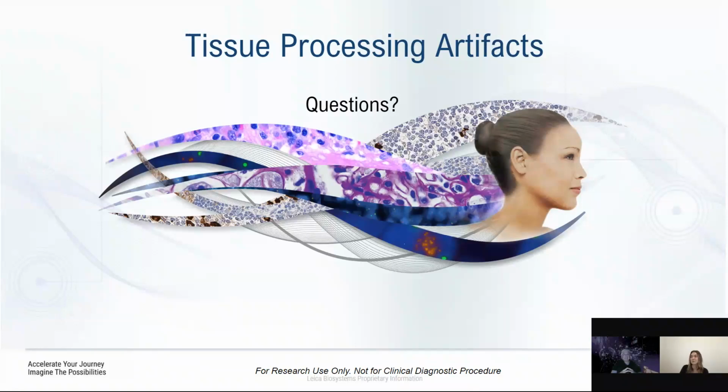Now, moving on, when performing reagent change on process, is there an expiration date different from the container to the process bottle? Should it be noted on the bottle for CAP, or state regulation? In the research site, that is a good question. I work on both sides. I work in clinical and in research, and it's a little bit different on the clinical side.